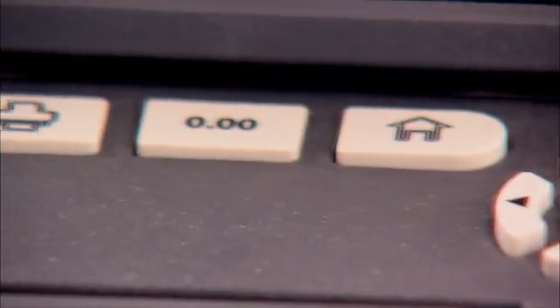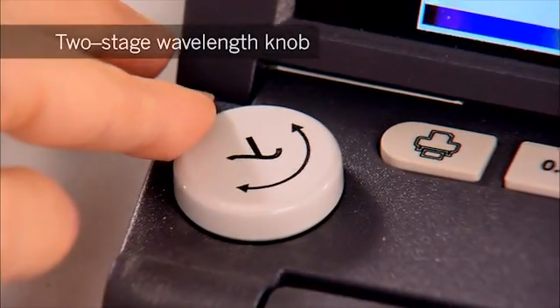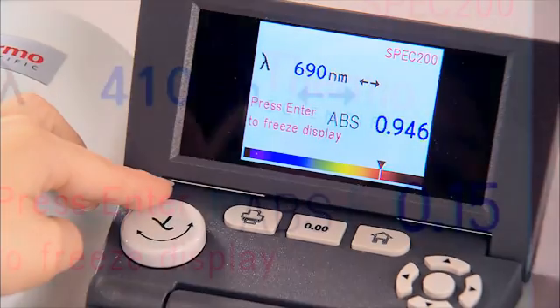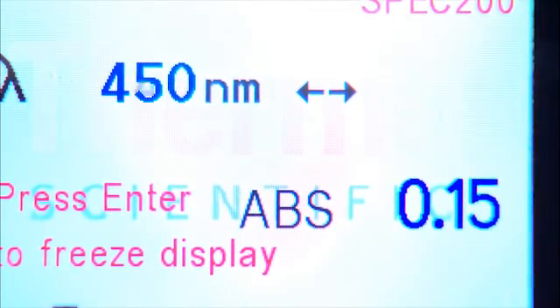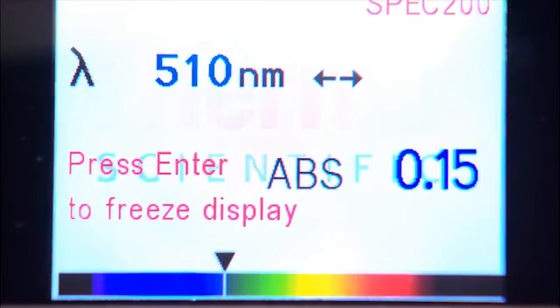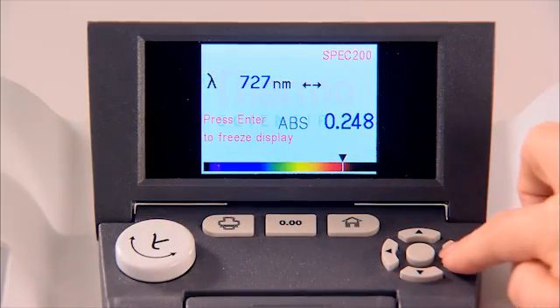The controls blend the modern and the familiar. The two-stage wavelength knob makes it particularly easy to set up the wavelength in an experiment. Modern live display mode shows wavelength and absorption, and the spectrum display helps students make the connection between numeric wavelength and the color of the light absorbed. You can also adjust wavelength with the keypad controls.